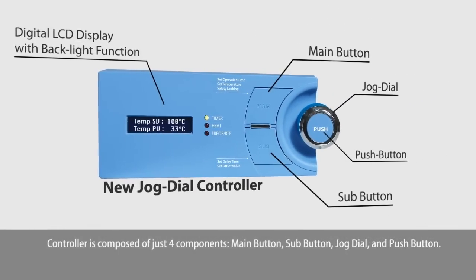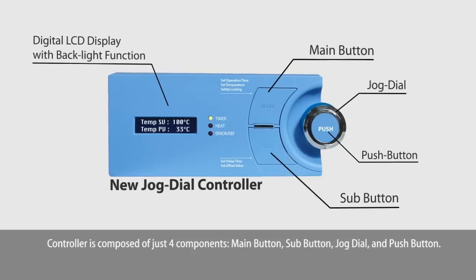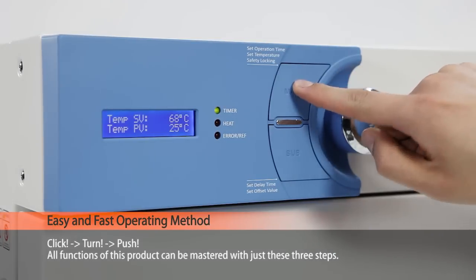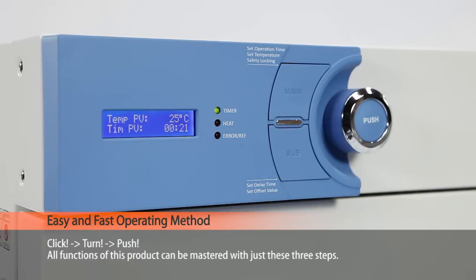The controller is composed of just four components: the main button, sub button, jog dial, and push button. Click, turn, and push — all functions of this product can be mastered with just three steps.